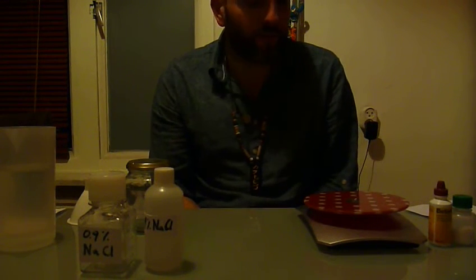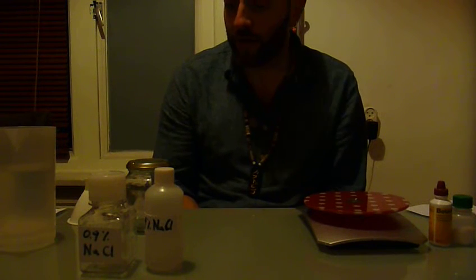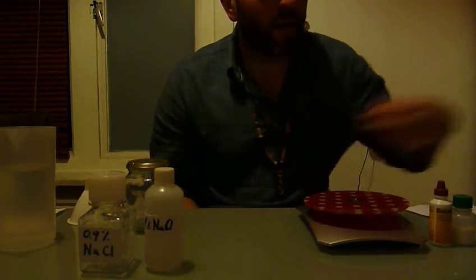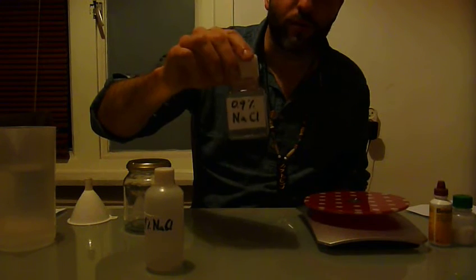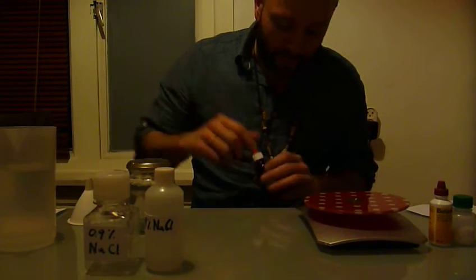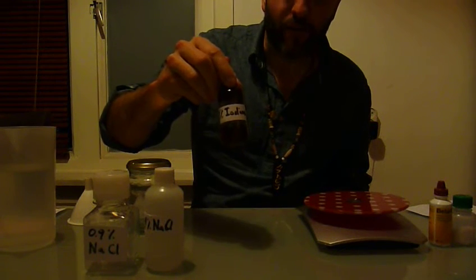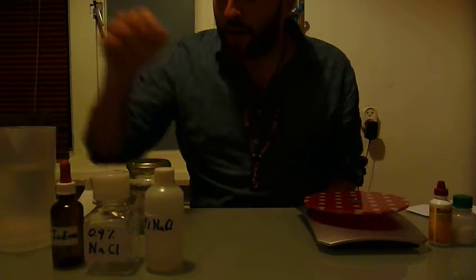Hi guys, I'm going to explain — or first we're going to make some solutions that we're going to need for the staining of the cysts. The solutions we're going to make are: first of all, a 0.9% saline solution — sodium chloride, or normal salt — and a 1% iodine solution, which is to actually stain the cysts.